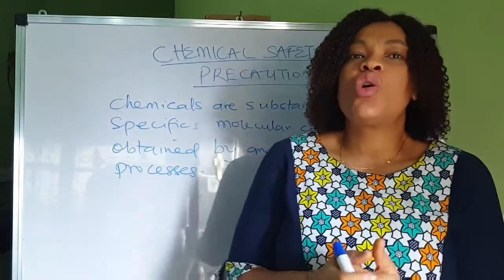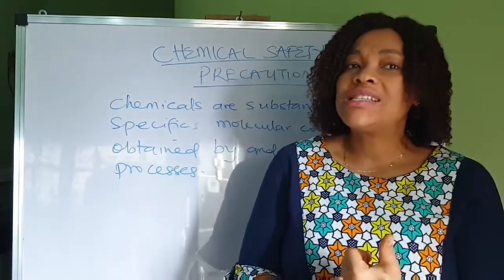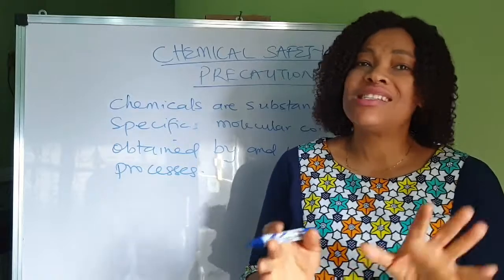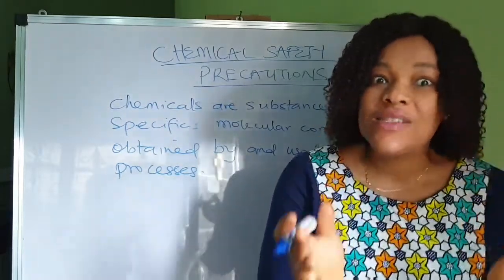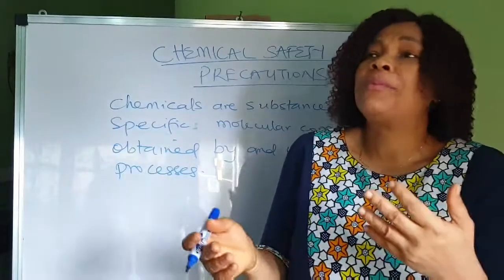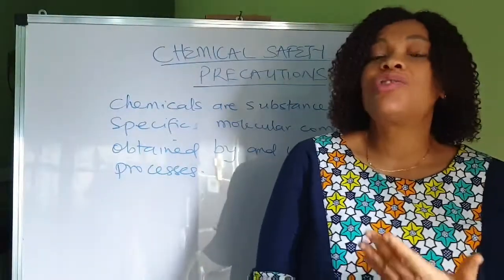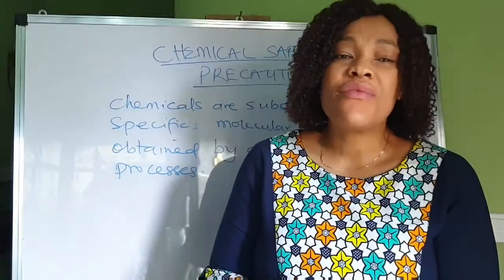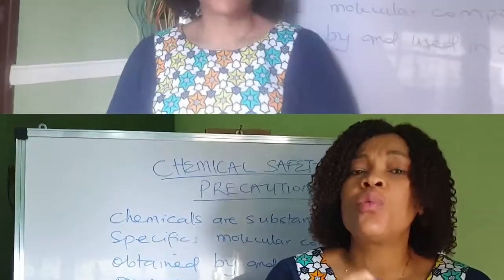Empty all used inoculated bacteria medium from test tubes or dishes into a designated container so that it may be sterilized before disposal. Especially if you're working with Petri dishes and you make some food for the bacteria, just make sure that you empty everything and wash, even with liquid soap and enough water.